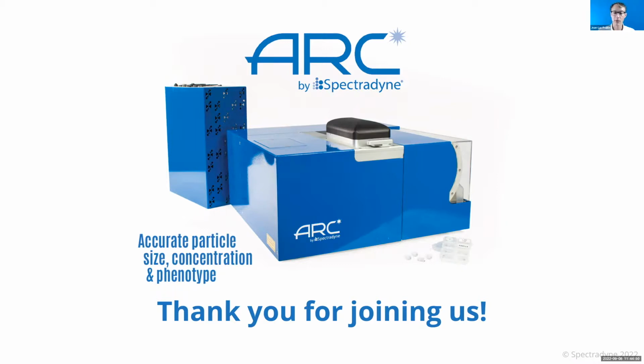Right, building off the drug loading question, this is from Chris Haycock. Thanks for joining, Chris. Are fluorescence measures limited to external loading, or can internal labels be measured as easily as well? We have not, actually, the reference particles, the polystyrene particles that we use, are internally labeled. So certainly there's some contribution from the internal fluorophores in the sample. My expectation would be, because the particles are small and for sure the excitation light will penetrate into the particle, that the answer is yes. But we'd love to check that.